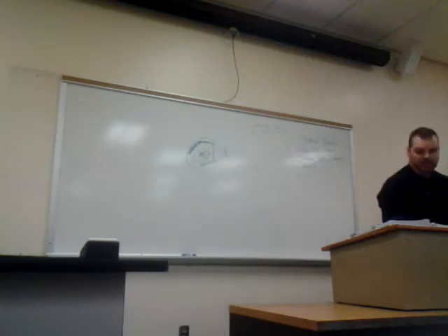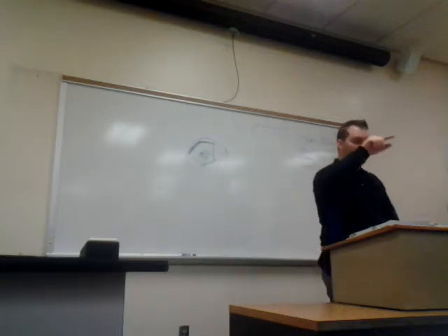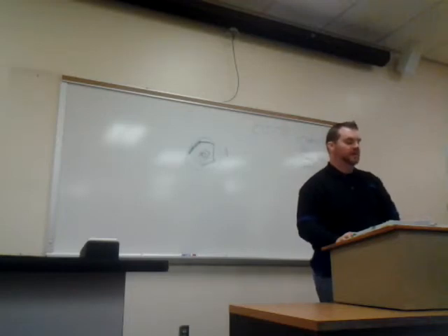That's what it's trying to show you there on that bottom slide, 286. They started on the one side and they went a little farther over, a little farther over, a little farther over, then they went into the middle once they got the pure sample. Okay. So that's how you get a pure sample for identification.